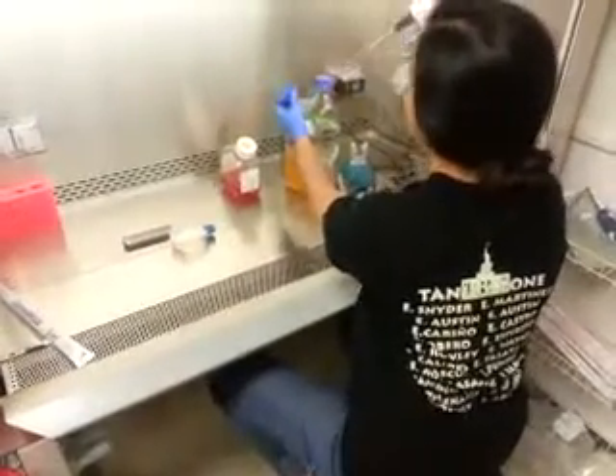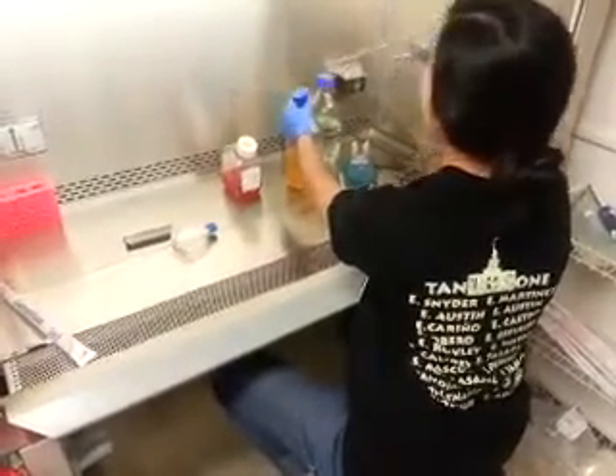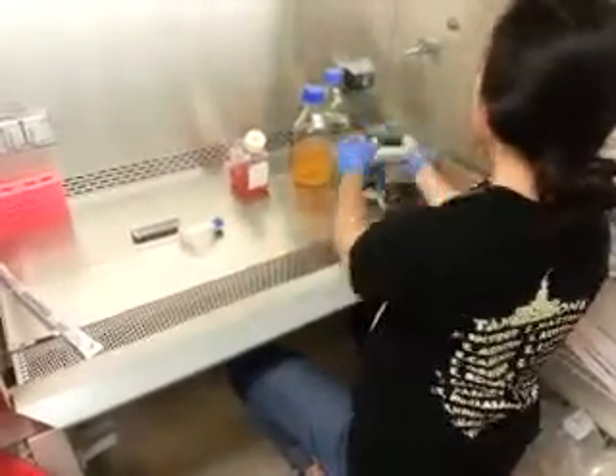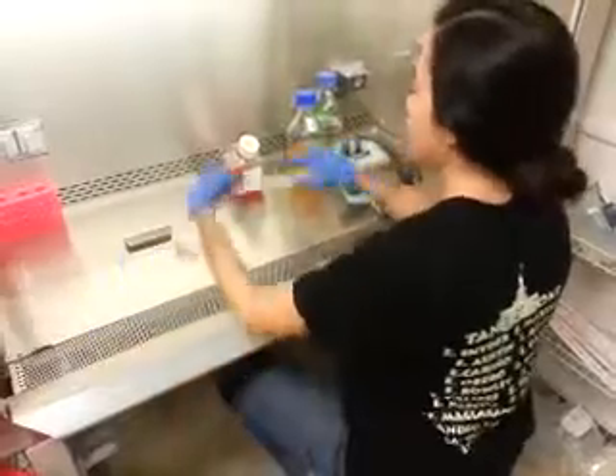Just toss the rest — you don't need them unless you want to make more flasks. When you want to store these cells, you can just set them aside.